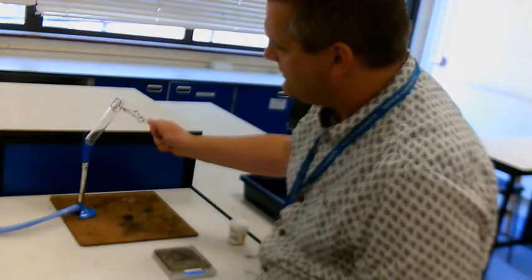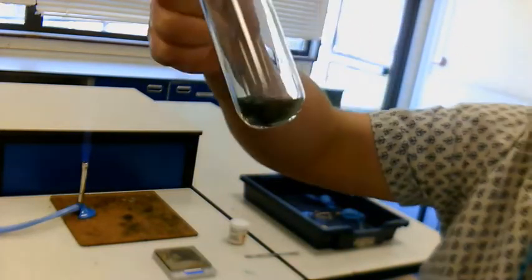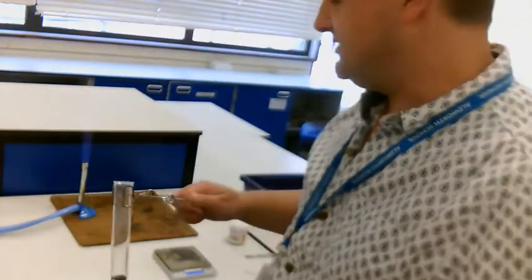So it's bubbling a little bit. If I bring up the camera, you might see my lovely green powder. Still a bit of green in there, but it's now mostly black. It's just turned into something else.